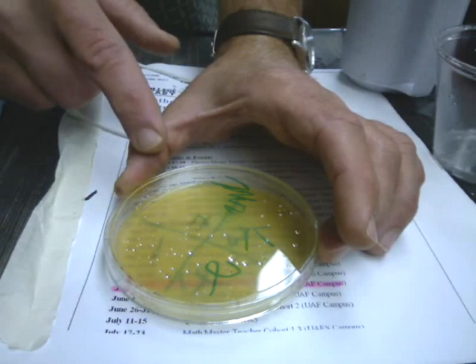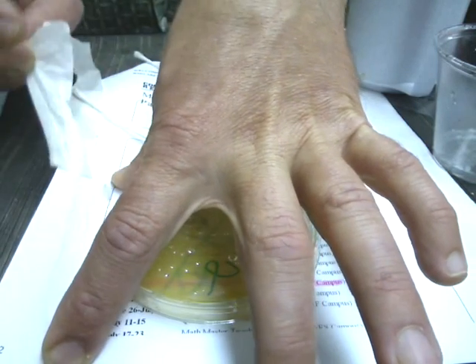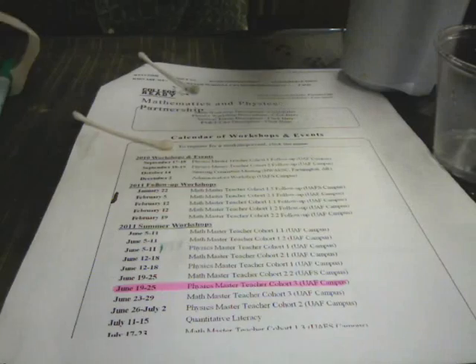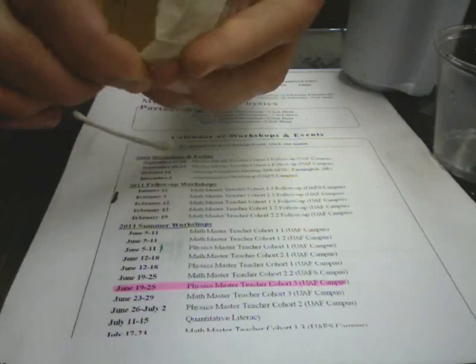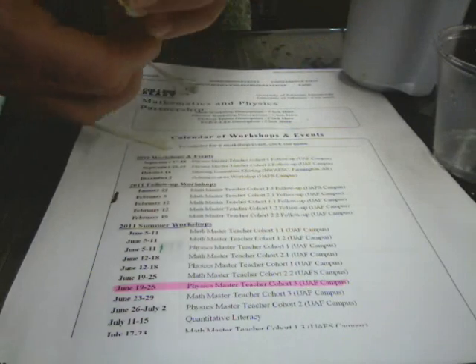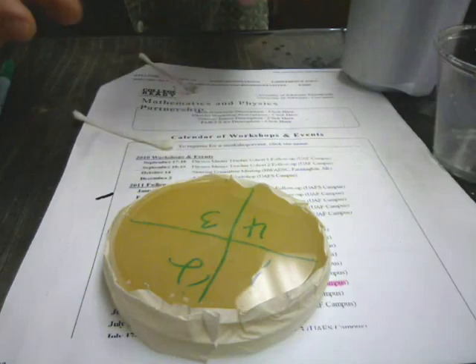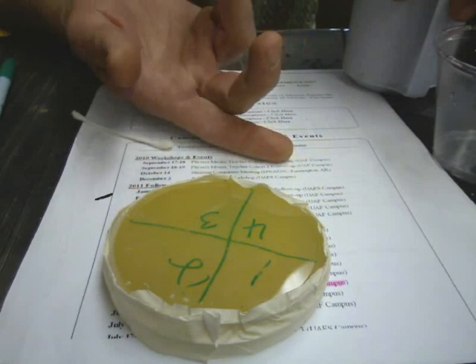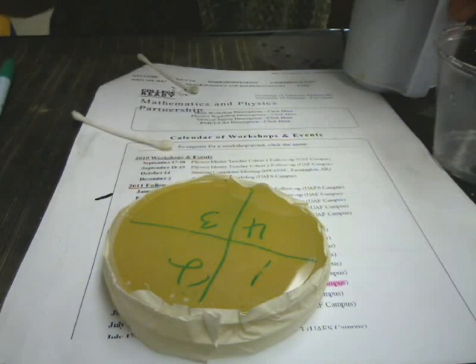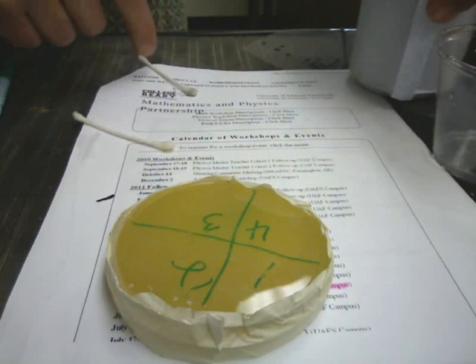After you've got everything applied to your plate, we're going to reseal it with our tape. Flatten the tape down so it makes a good seal to keep any dust out and make sure this doesn't fall apart as you're handling it. This needs to be stored upside down. That way, if condensation forms, it won't be dripping down on the bacteria. That will help keep everything where it belongs, because if condensation splashes down, it can cause it to move around or drown some.